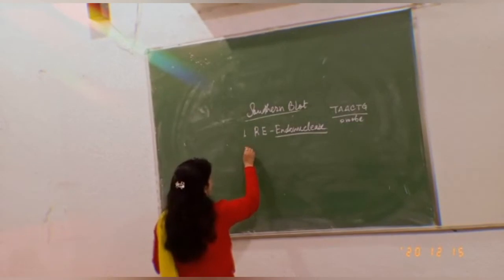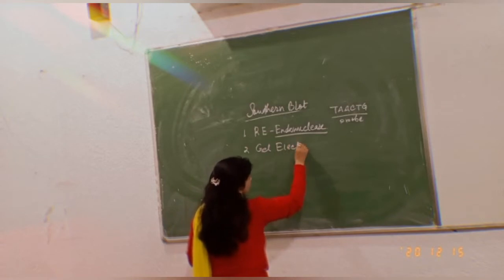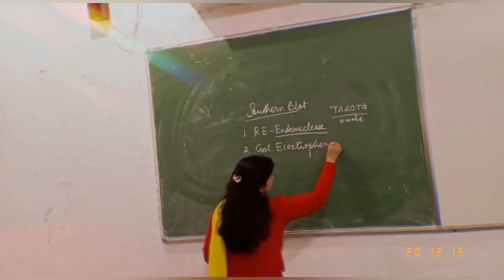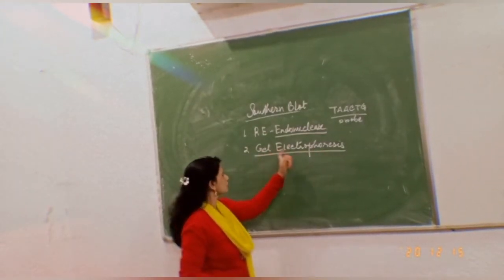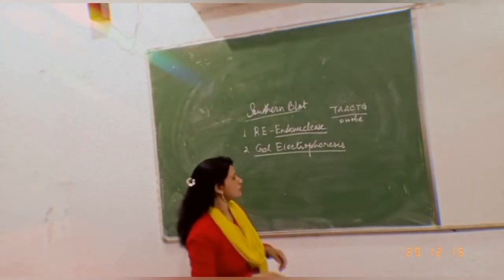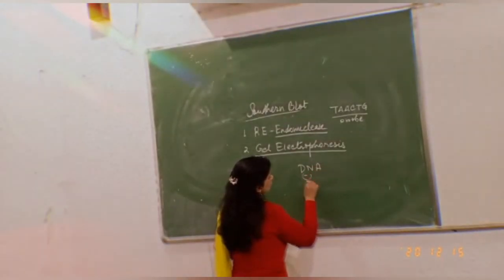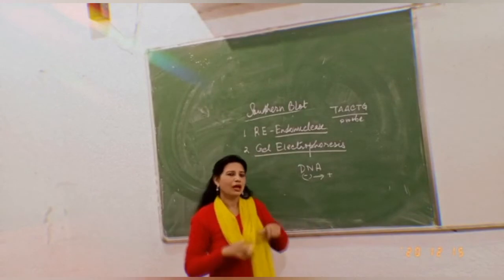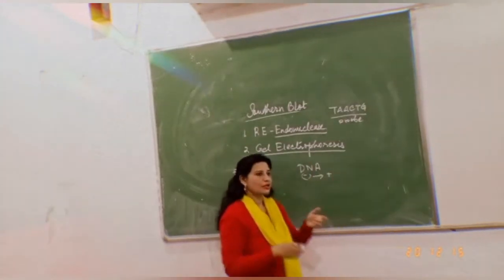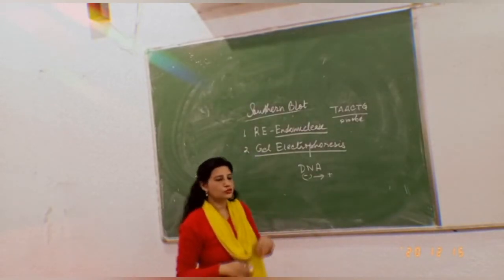Now these smaller fragments will be put through gel electrophoresis. Why do I need this process? If you have not watched my video on gel electrophoresis, I insist that you watch it, because this technique should be learned early. A quick revision: there is a chamber, there are electrodes, and DNA is negatively charged, hence it will move from the negative end, the cathode, to the anode. While it is moving, I can divide the fragments according to length: which is big, which is small, which is large, which is quite medium size.